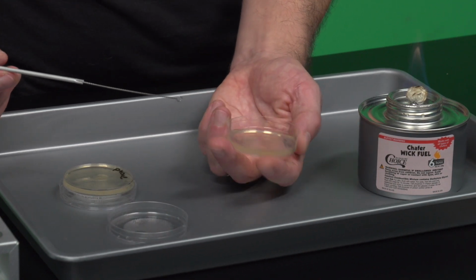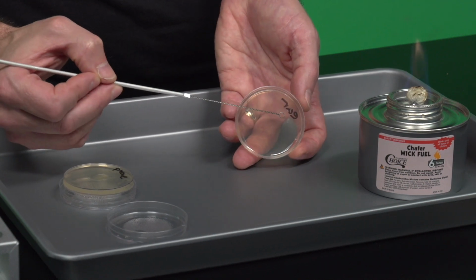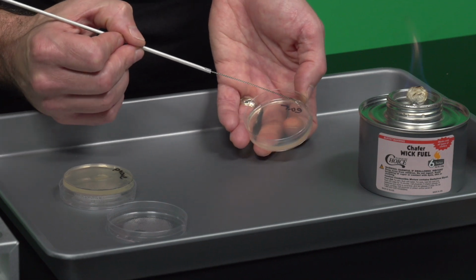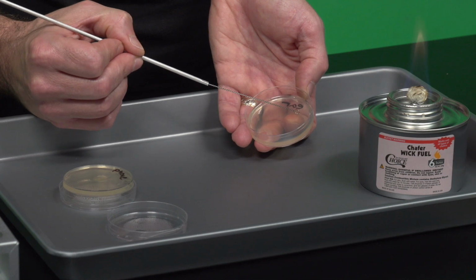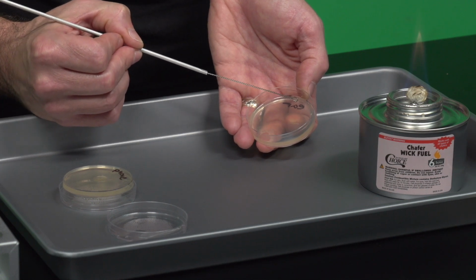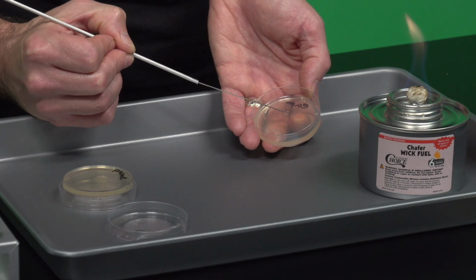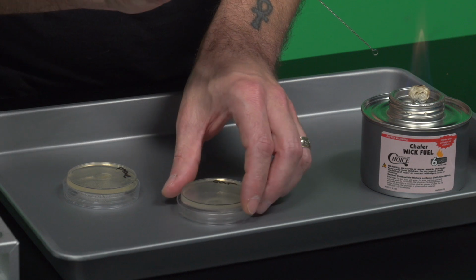Okay, so I find quadrant 1, which is right along here, right? There's quadrant 1. And so what I'm going to do is go ahead and streak from quadrant 1 into quadrant 2, back into quadrant 1, into quadrant 2, back into quadrant 1. Now I'm back into quadrant 2, and now I'm staying in quadrant 2 a couple times. Okay. And then you would flame, but I'm not going to right now.